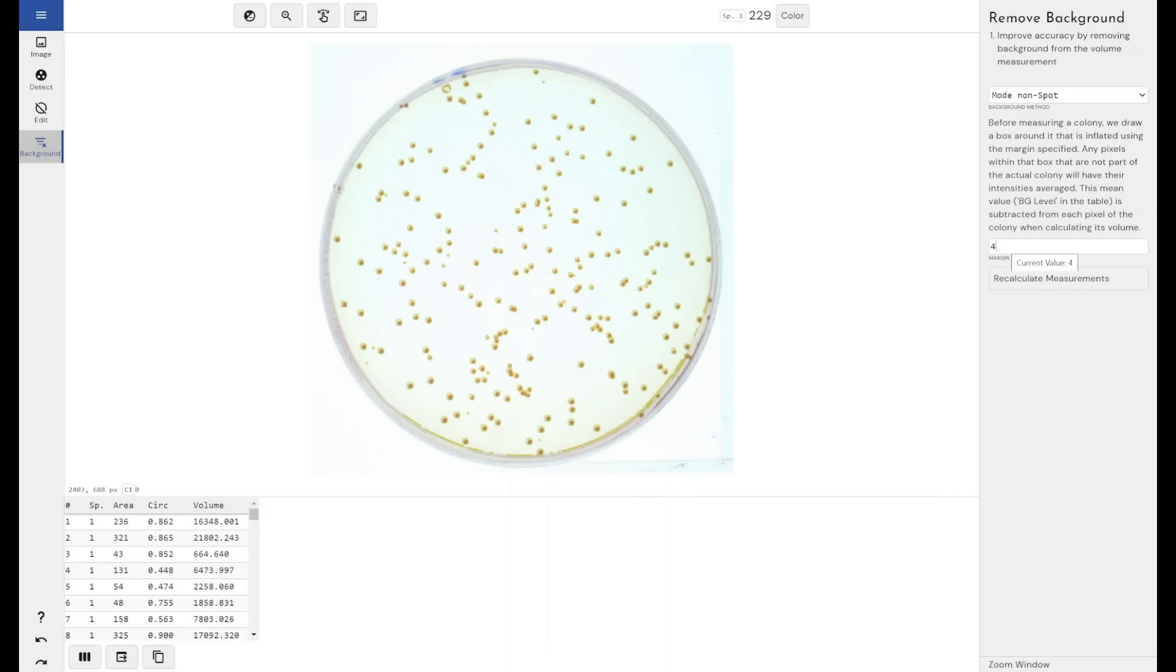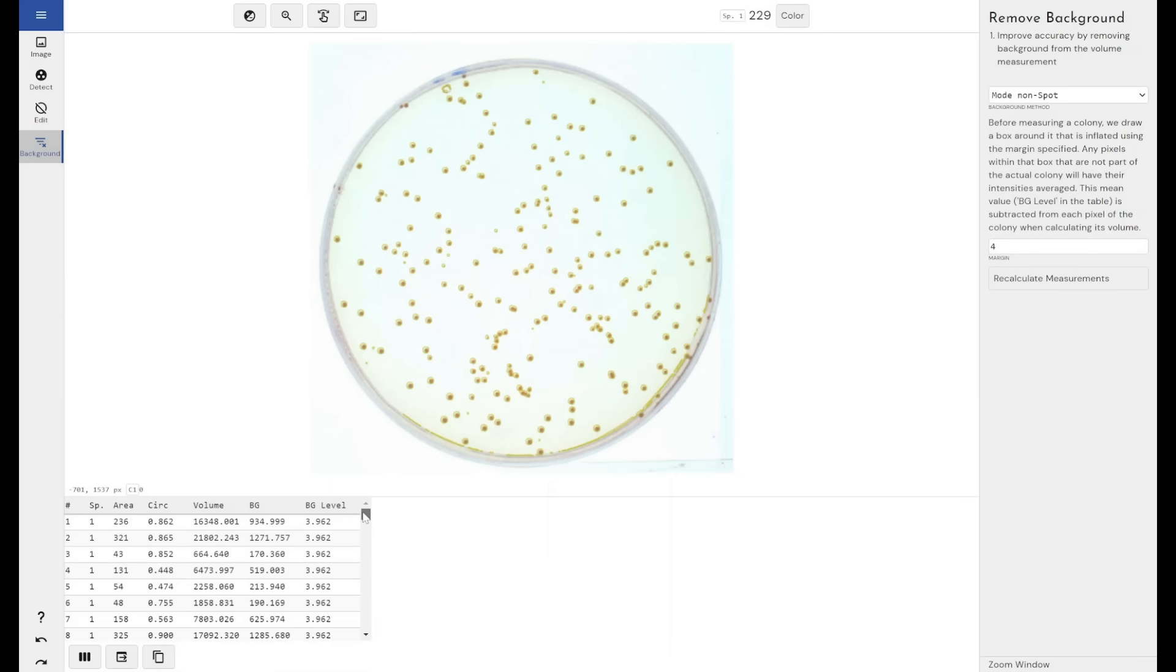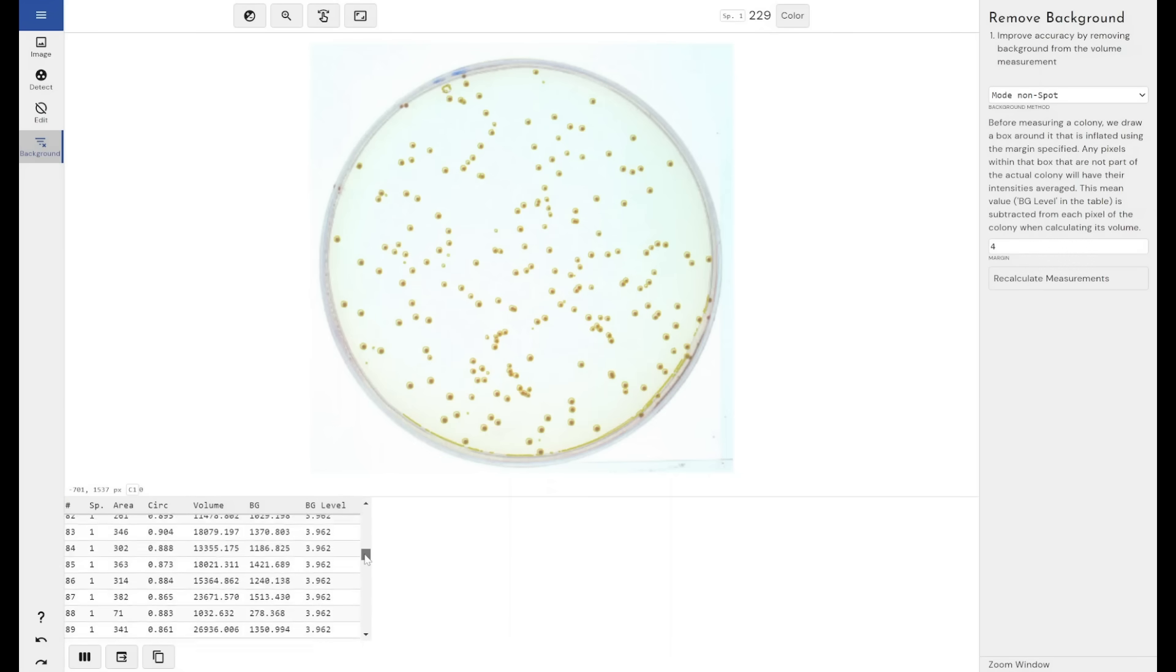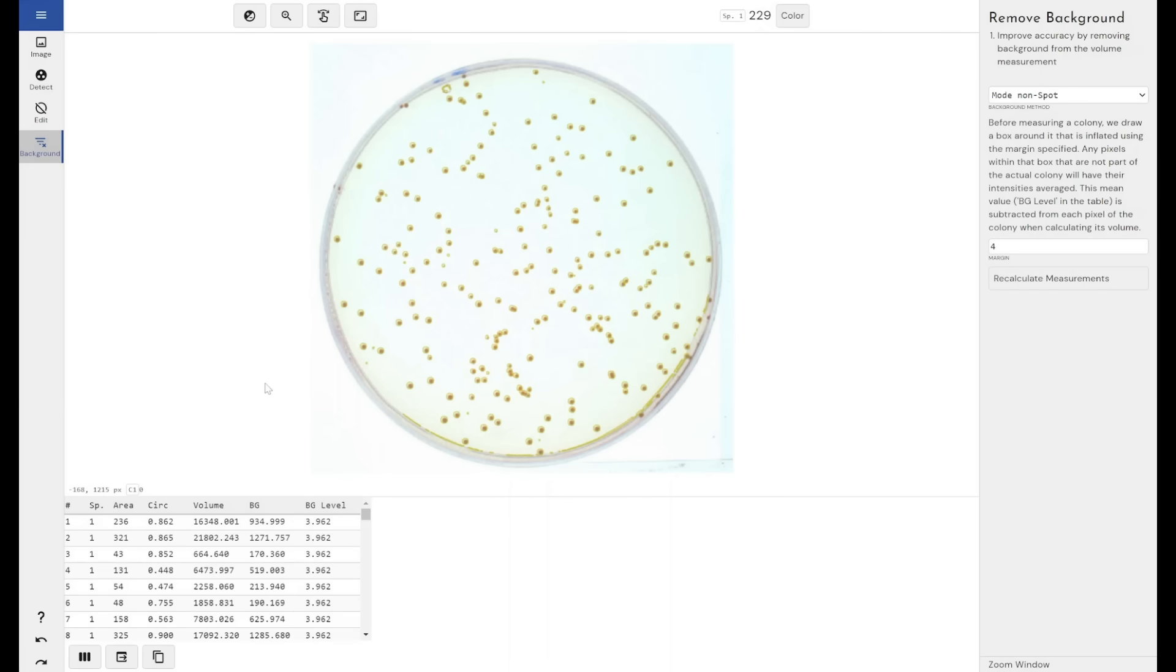But this is quite a sparsely populated plate and so for the majority of colonies in this plate mode non-spot would be a good background removal method but we've always got image rectangle for removal as well. You can turn on the background results so you can see what the background value is and what's been removed and how we've reached the results that we have.